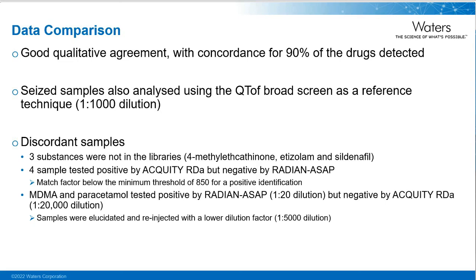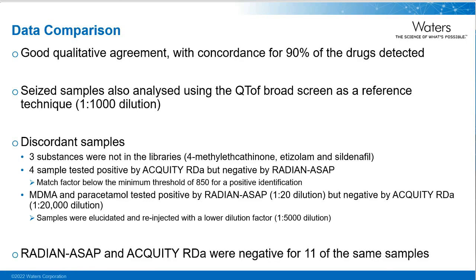This preliminary proposal was also supported by the analysis on the QTOF, and the samples were subsequently reanalyzed on the ACQUITY RDa following a lower dilution factor. And finally, both techniques were negative for the same 11 samples.